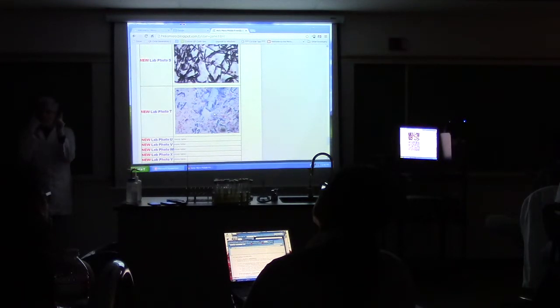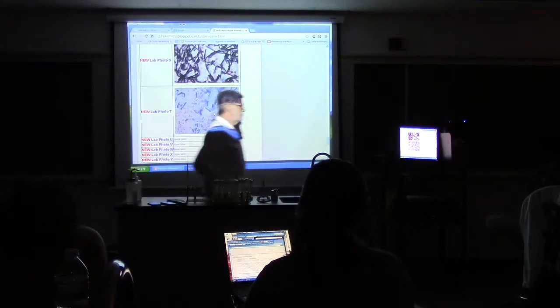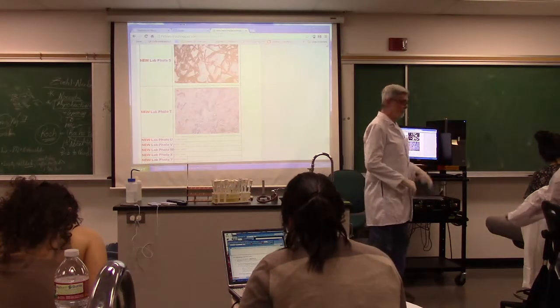So today when I'm asking you questions, just say acid-fast positive or acid-fast negative. Remember on a test, the correct way to say acid-fast positive is acid-fast. And acid-fast negative? Non-acid-fast. All right, so flip on all the lights. I'm going to do the demo, and then we're going to do acid-fast staining forever.